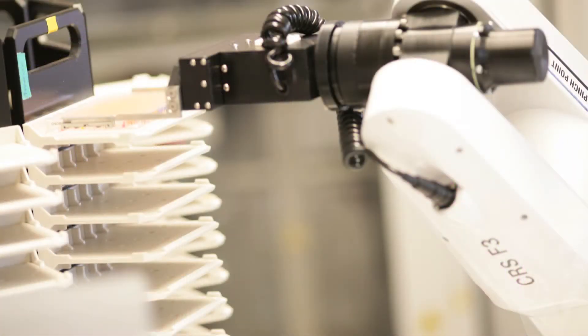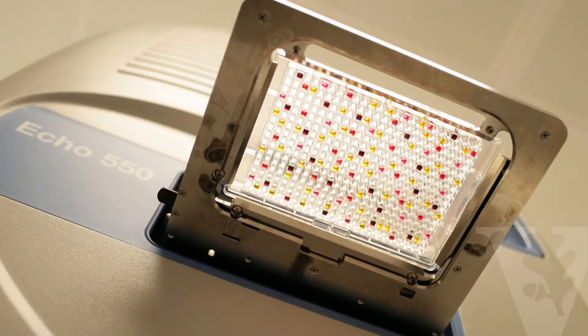Our goal is to facilitate the discovery of novel compounds for both probe and pharmacological development.